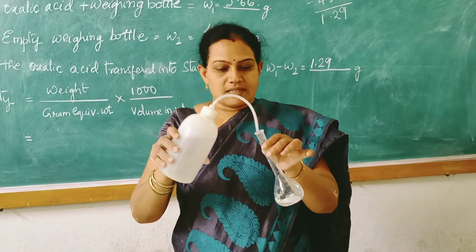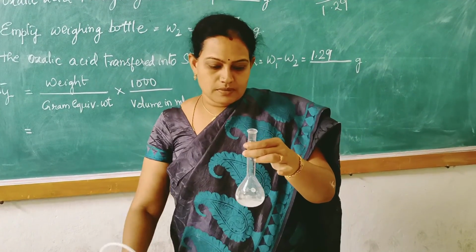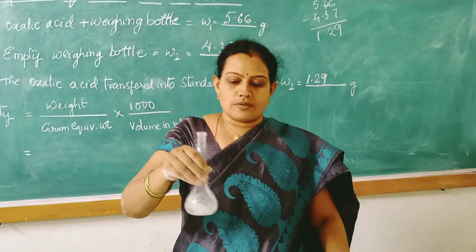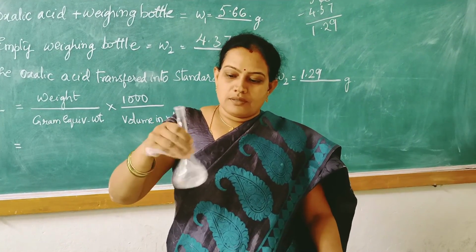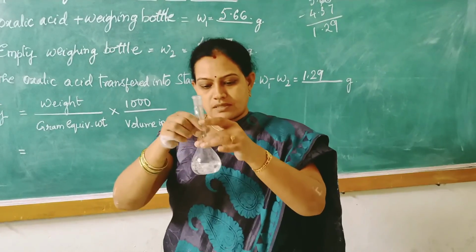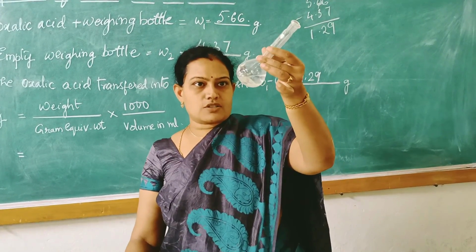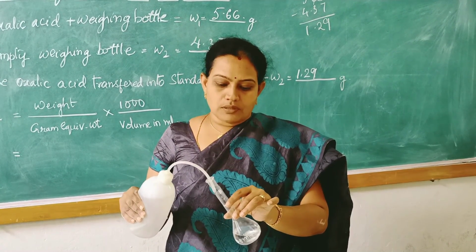Now this is the standard flask, and I am collecting all that salt adhering to the sides of the container and preparing a uniform solution. So shake it thoroughly with an adequate amount of distilled water, and once it gets totally dissolved, you have to add the rest of the water until the mark.